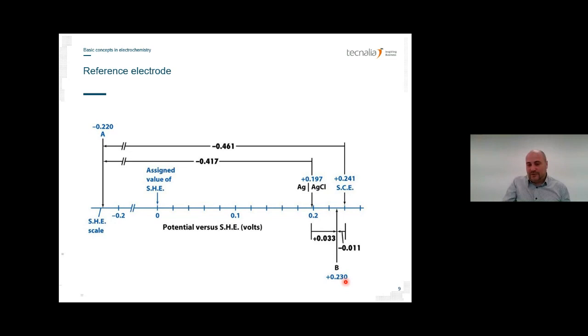So I wanted to attract your focus on this point, that the kind of reference electrode that is used is very important to mention.